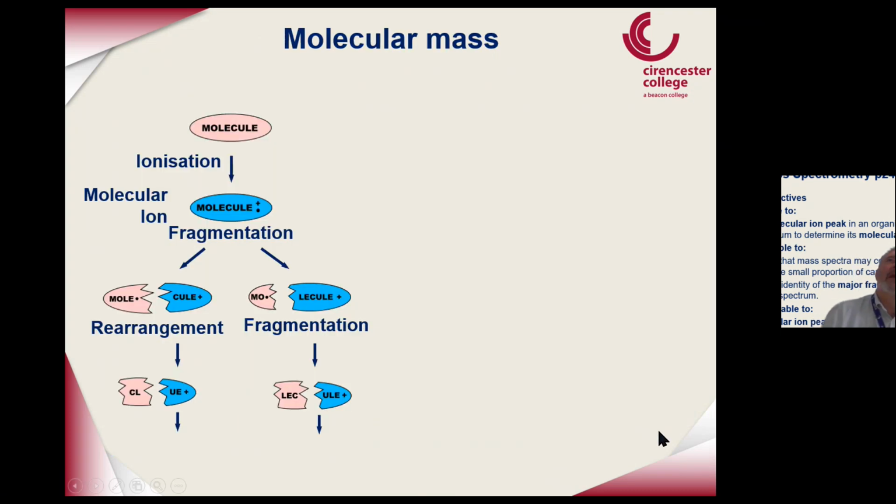So let's look on. In chapter 2, what you looked at was perhaps having a mixture of bromine isotopes. So you could have bromine 79 and bromine 81. And you would find you'd have 2 peaks, of 79 and 81. And the ratio of those peaks would be approximately 50-50, probably slightly in favour of 79.